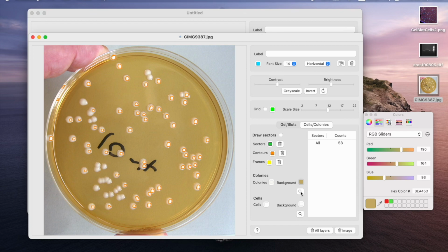If we do this, then we detect single colonies. As you can see, in some cases we didn't detect cells because they are together or have a slightly different color. To count these colonies, we can click and drag, and then you see this yellow box.